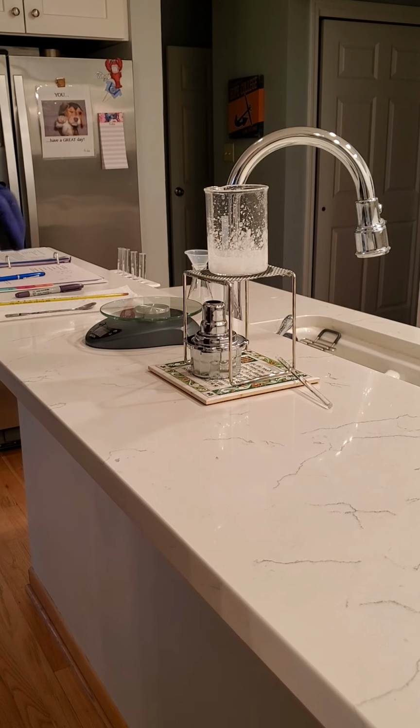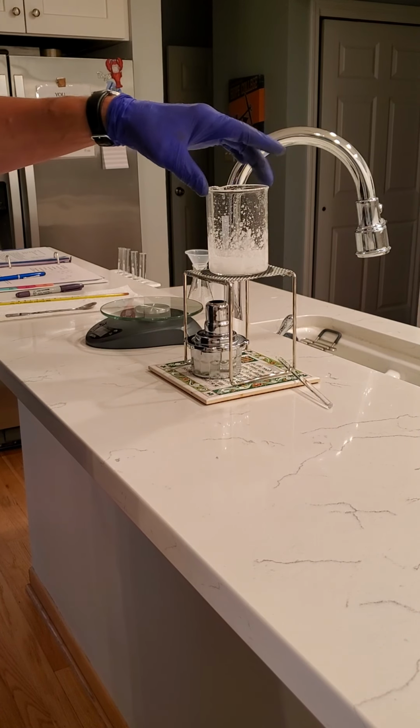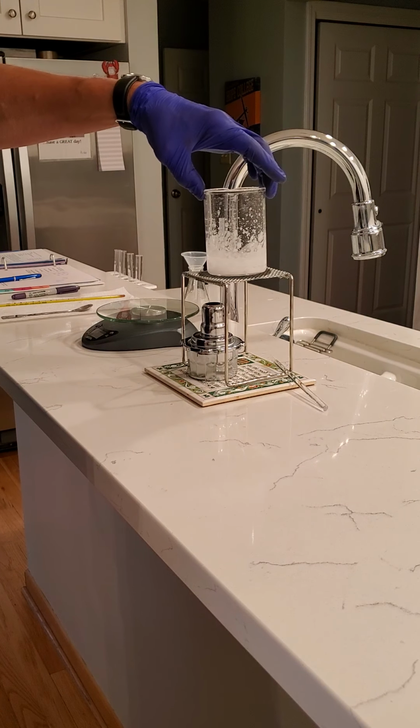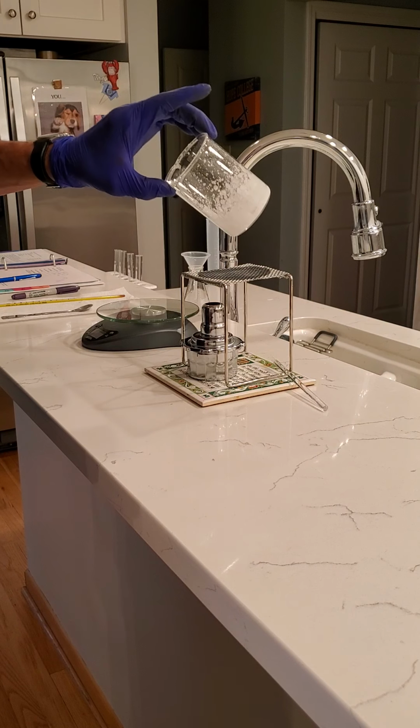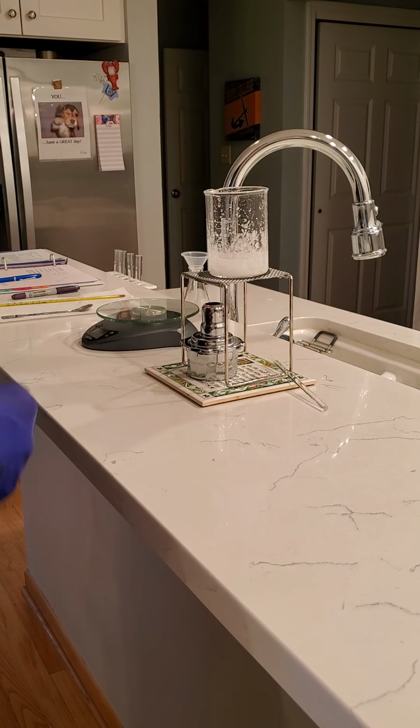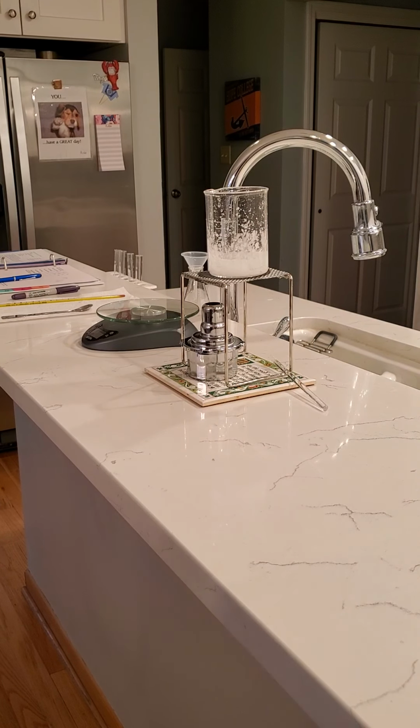Okay, class, you can see I've turned off the burner now, and our beaker is still hot, but I'm going to let it dry. All that's left now is the solid salt. We're going to let that cool and completely dry, and then we'll reweigh and see how much salt we have left and how much salt we're able to get into that amount of water.